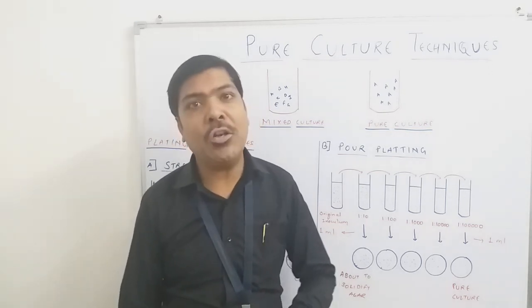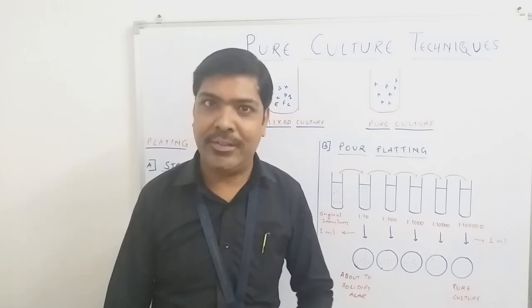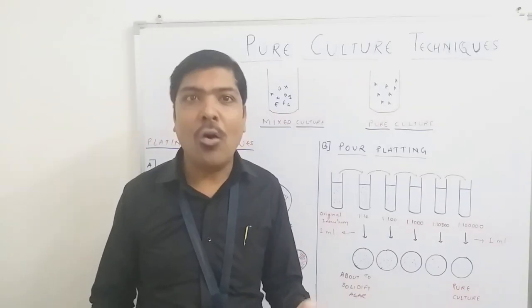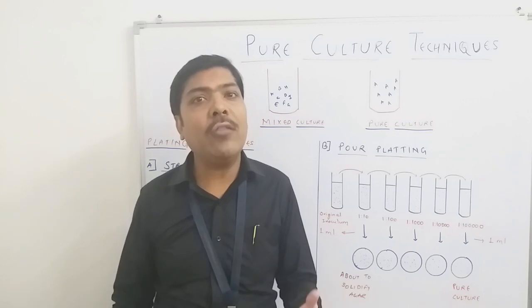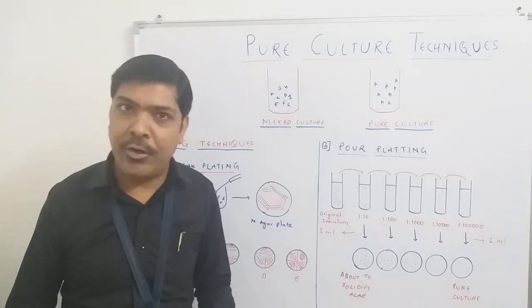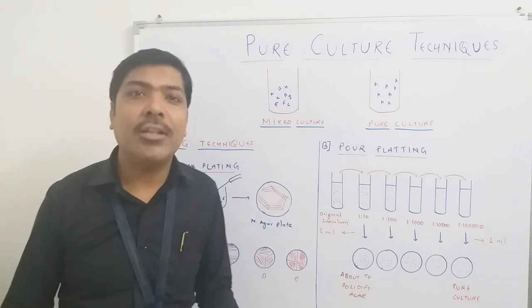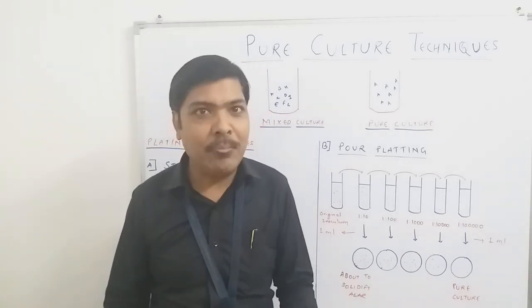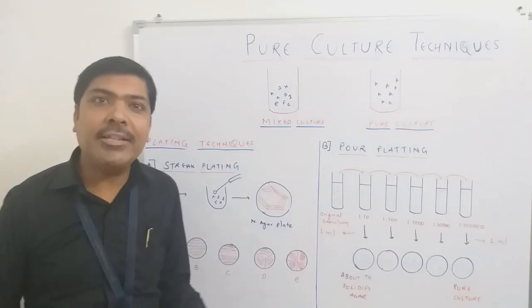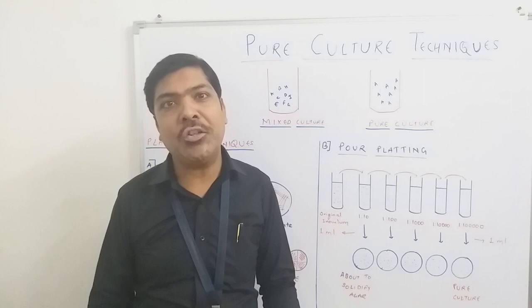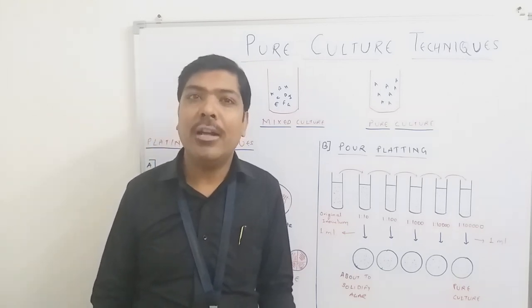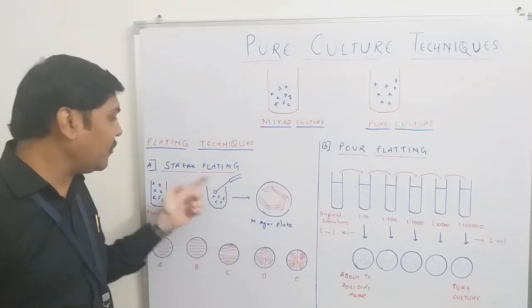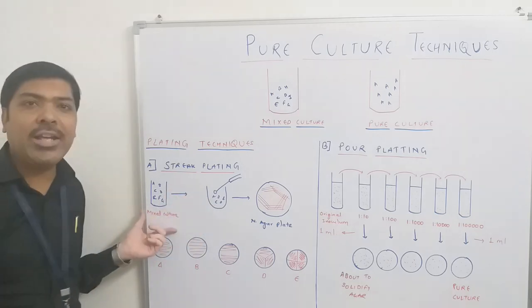The sterilization process of the inoculation loop is very easy. We place the nichrome wire loop on a Bunsen burner and wait until it becomes red hot. Once it becomes red hot, we wait a few seconds to let it cool. Because of this red-hot exposure to the flame, whatever microorganisms or bacteria were initially on the surface of the inoculation loop will be destroyed and the loop becomes sterilized.